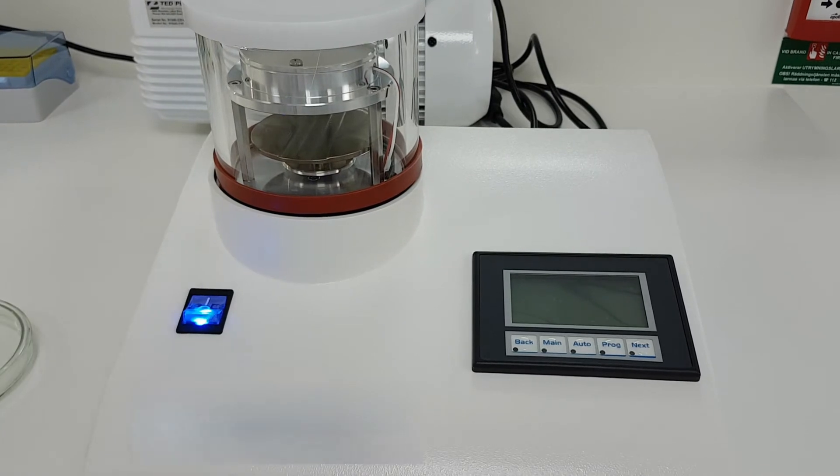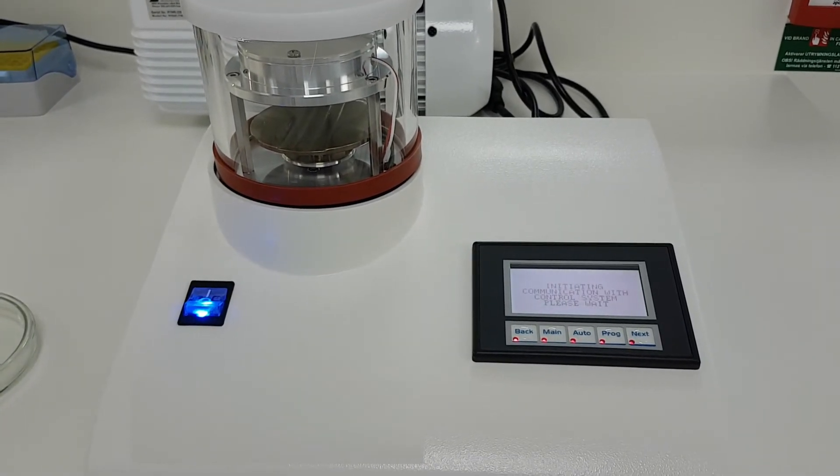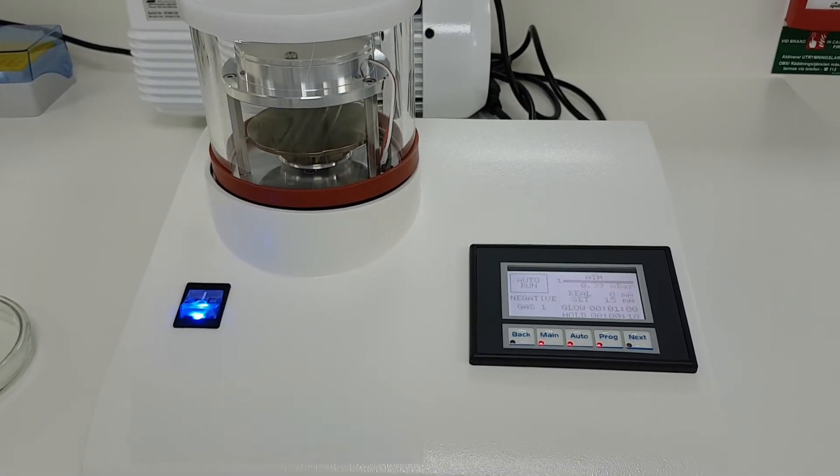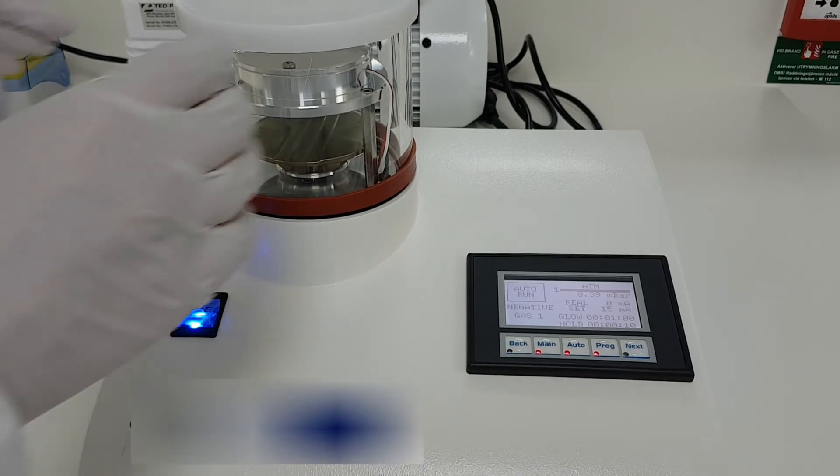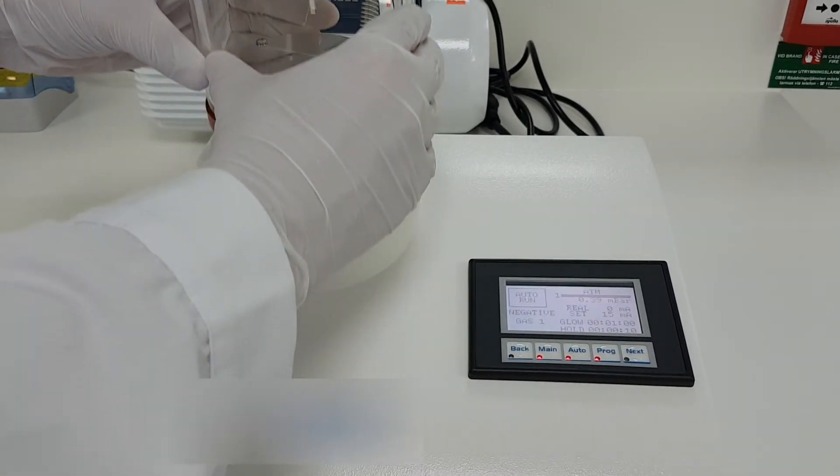Turn on the glow discharge unit. Remove the glass lid of the glow discharge unit. Place it on a clean surface to avoid dust contamination.